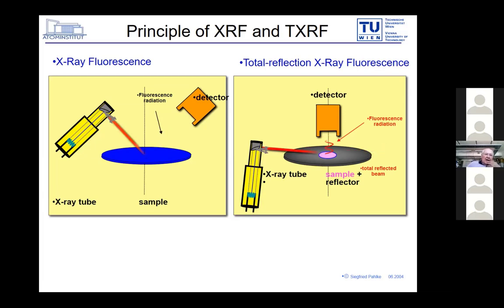And you see the biggest difference in conventional excitation. We go under certain angles on the surface. All the interaction processes, the photo effect we like, but the scattering we do not like, because it is creating background. It is fully detected by the radiation hitting also the detector.